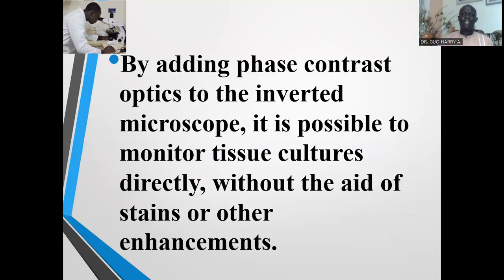By adding phase contrast optics to the inverted microscope, it is possible to observe tissue cultures directly without the aid of stains or other enhancements.